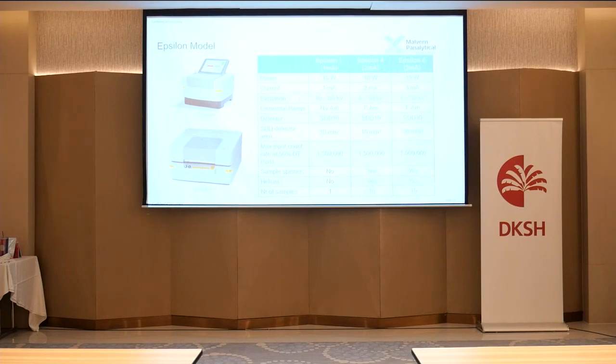For the battery materials, lithium cannot be analyzed even with WD-XRF. Because lithium does not emit in the X-ray range, it is more below the X-ray range because it is a very light element. So lithium anyway cannot be analyzed, and all other elements which are present can be analyzed with EDXRF. So I would say that for battery materials, unless you have a very high throughput kind of analysis, because WDXRF can take multi-sample changers, auto sampler, otherwise, you can analyze it with EDXRF. So the rest of the few slides I will show are on the EDXRF.